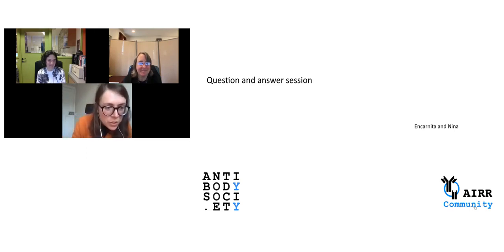There's a question. Have you tested the unique dual index primers on pattern flow cells to mitigate index hopping in AIR sequencing?